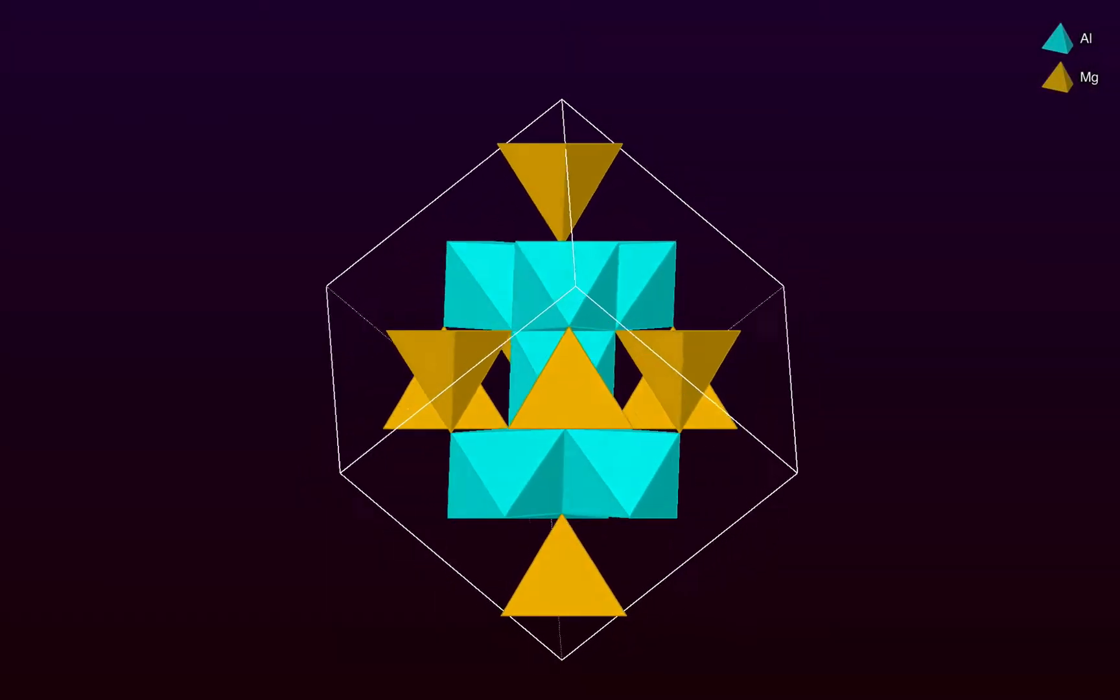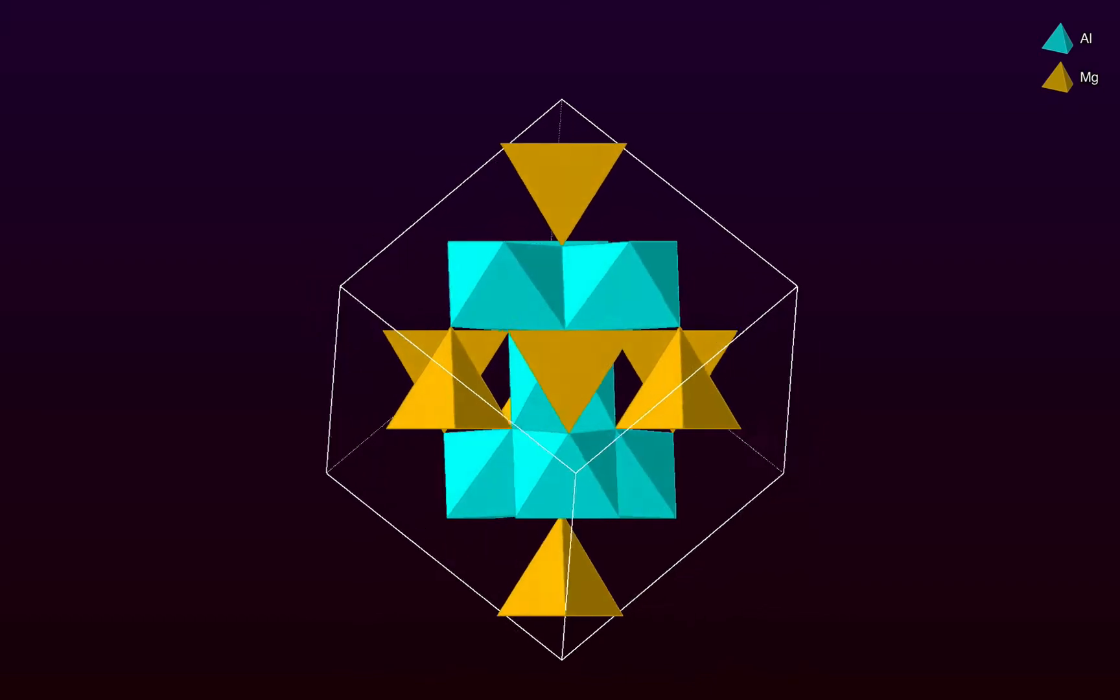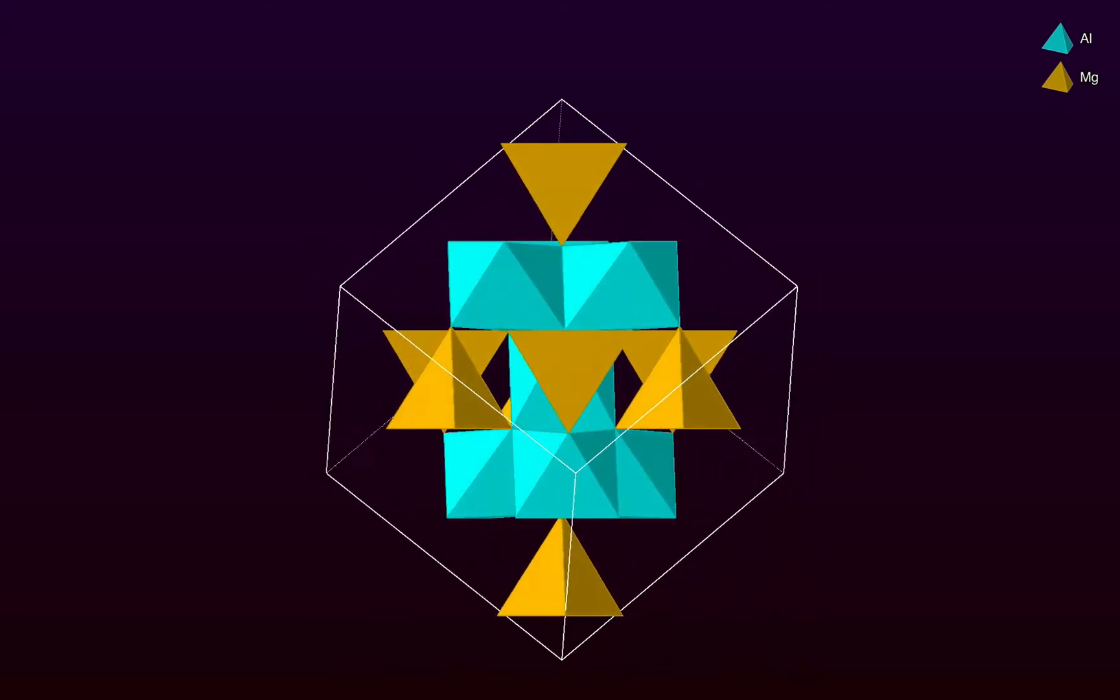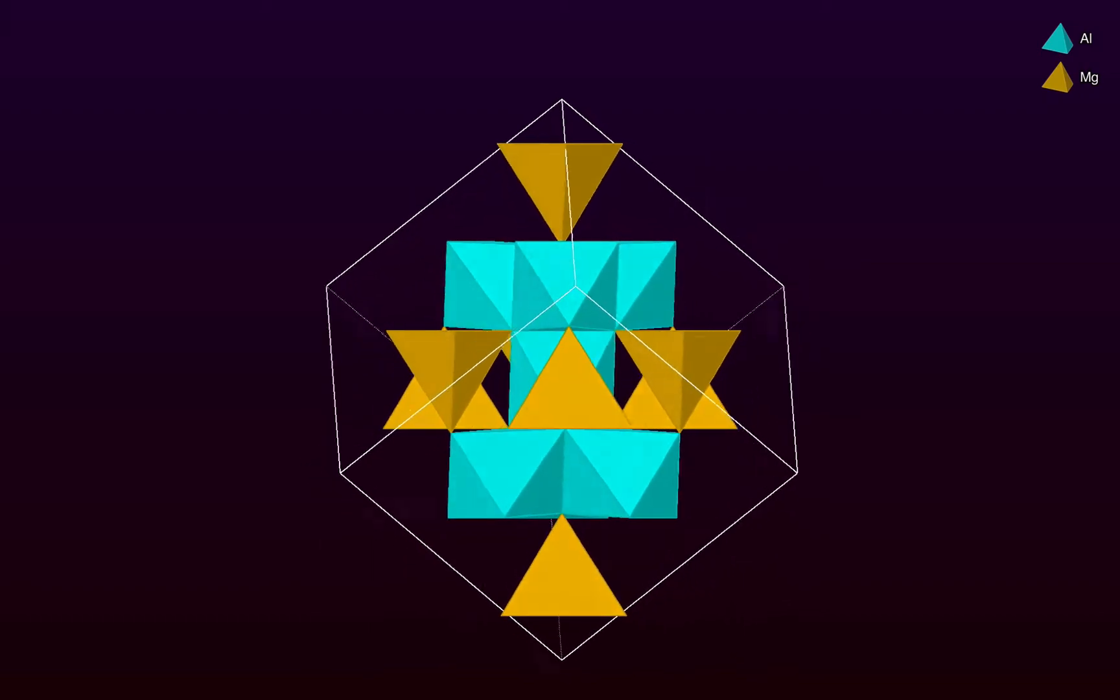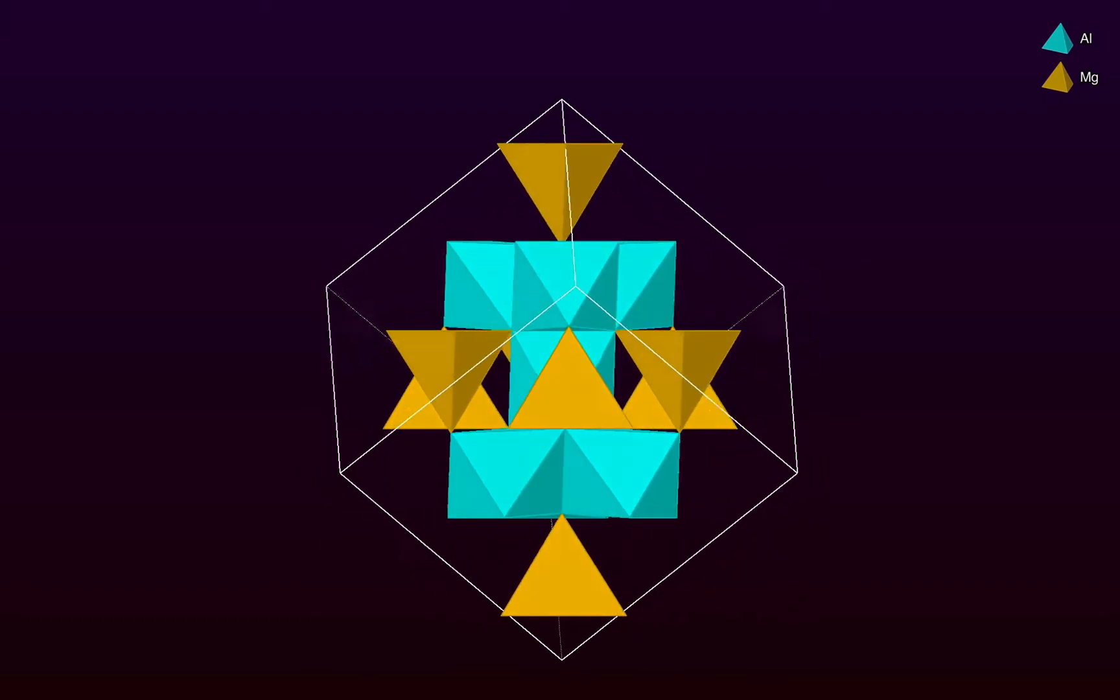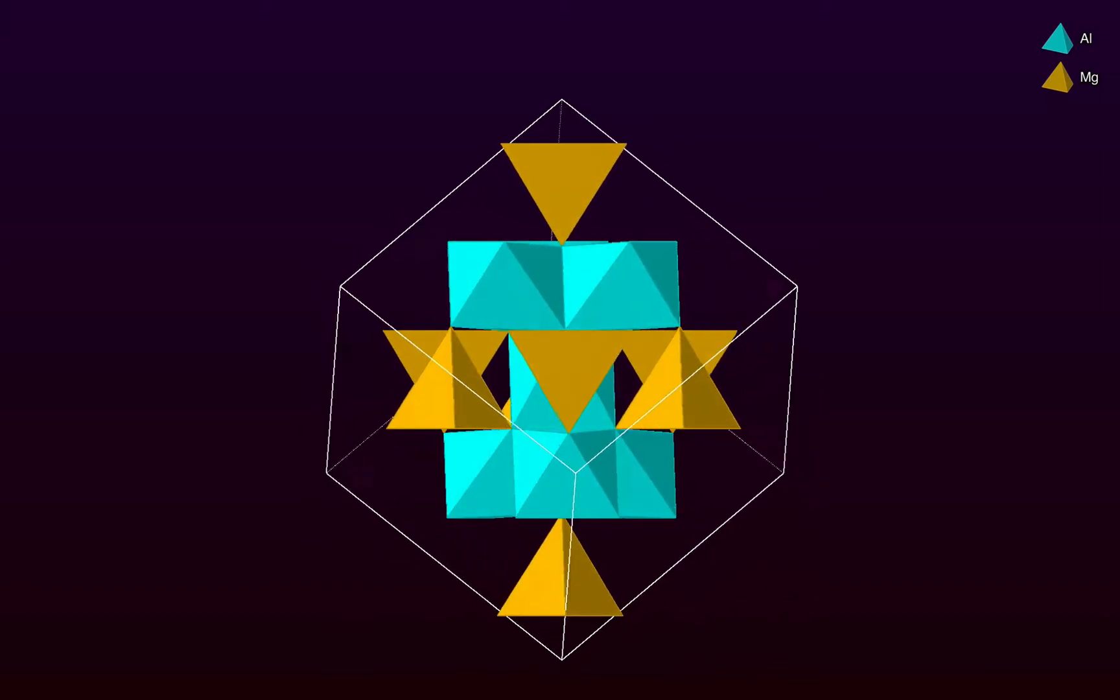Welcome to CrystalMaker 10. In this tutorial we're going to have a look at the selection tools available in CrystalMaker and use those to investigate the coordination environments around aluminium and magnesium atoms in the crystal structure of spinel.